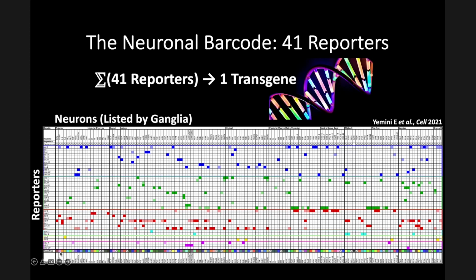with color. So the reason this neuron here, which is called SETV, doesn't really matter what its name is. It's a ventral cephalic neuron, but again, that doesn't matter. The reason it's purple is because a dopamine transporter reporter is driving red in it, and a cholinergic receptor reporter is driving blue in it. And the combination of blue and red to your eye looks purple.